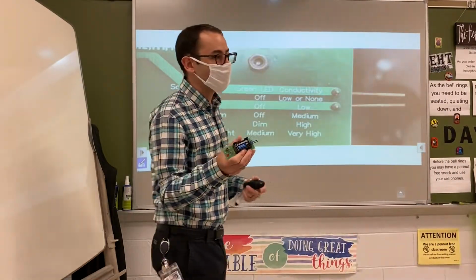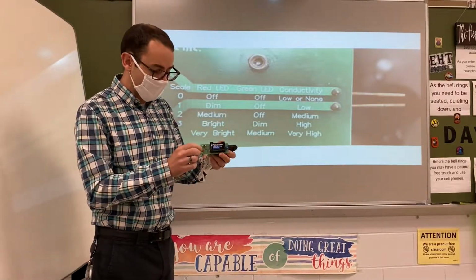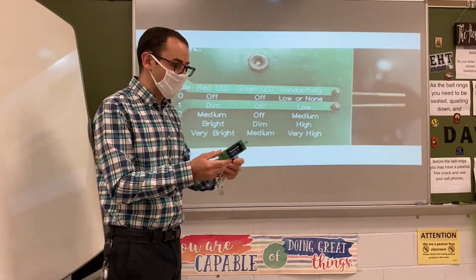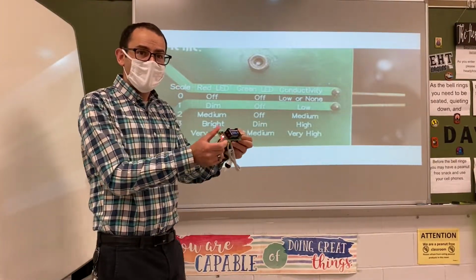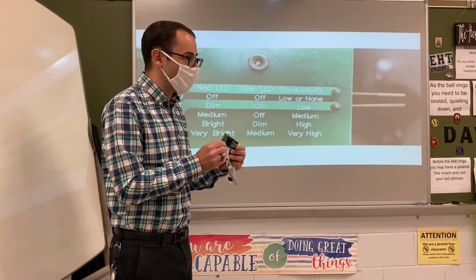We saw these when we did our lab with conductivity and when we were talking about the solids. And there's a switch on here, you just make sure that it's on. Nothing should light up because air doesn't conduct electricity. But if you were to squeeze these 2 little pins together, you would see it light up bright, right? Both of them kind of light up bright there. Now that's because it's metal and metal touching, and metal conducts electricity really well, right?